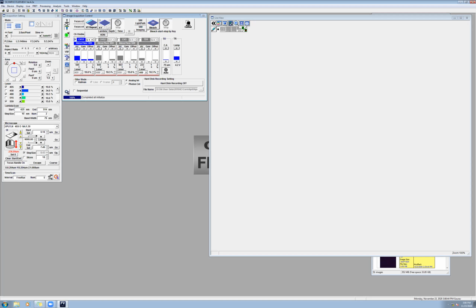When you are ready to see your sample on confocal, you can hit focus times 4. Now, what you will see over here is you have a bunch of options: focus times 4, focus times 2, an XY repeat, and an XY image scan. What all of this means is the following.